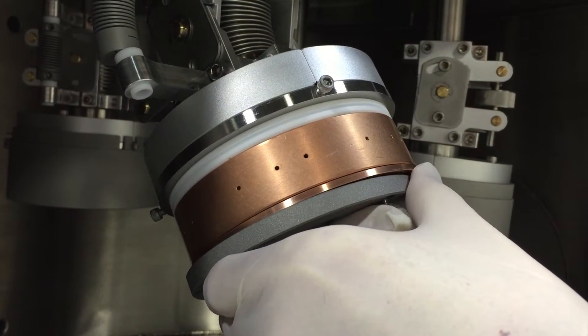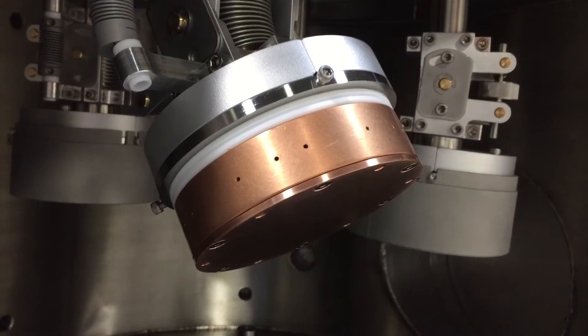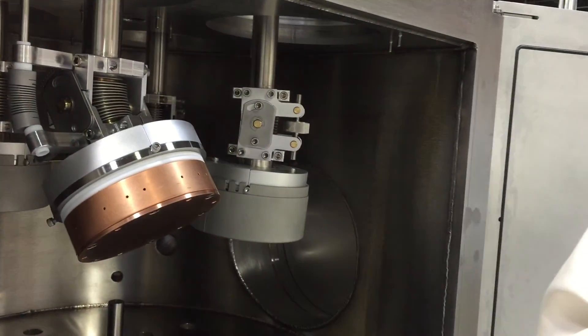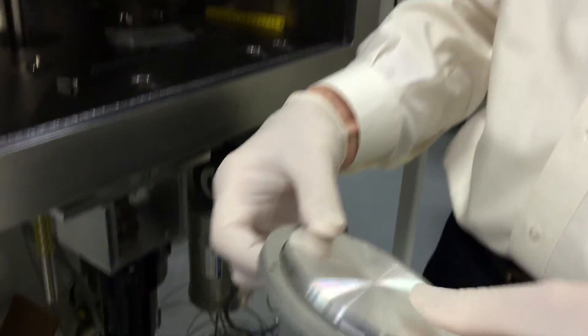Once all of the screws have been removed, pull the target retainer down and the target assembly will come with it. It's a simple process to replace the target by just reversing the steps we just did.